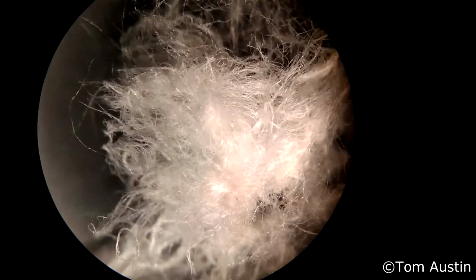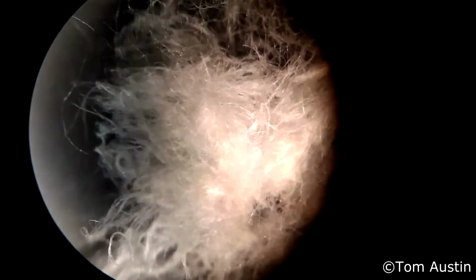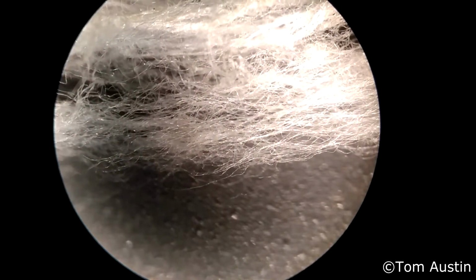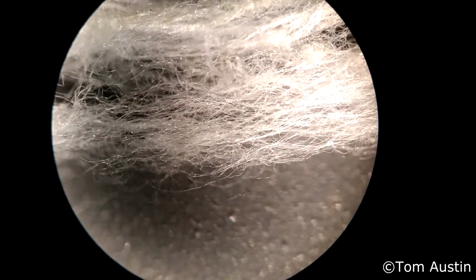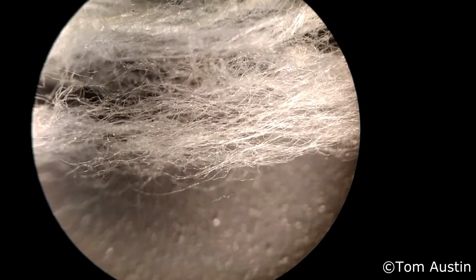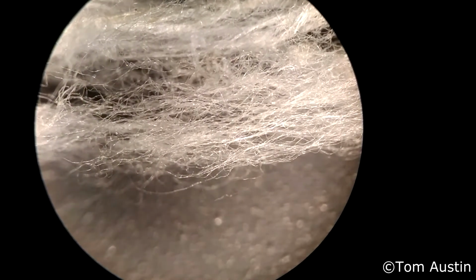Here's just another even more tightly bound nep. I think this one actually has either a piece of seed coat or a piece of the ovary attached. Here's another little random piece of lint that I had that got orphaned. I believe this came off of the mature boll that I showed you earlier. Seed. I don't know why I keep saying boll. Here you can see just very straight, helically arranged fibers. Nothing crazy going on. Just straight and clean.